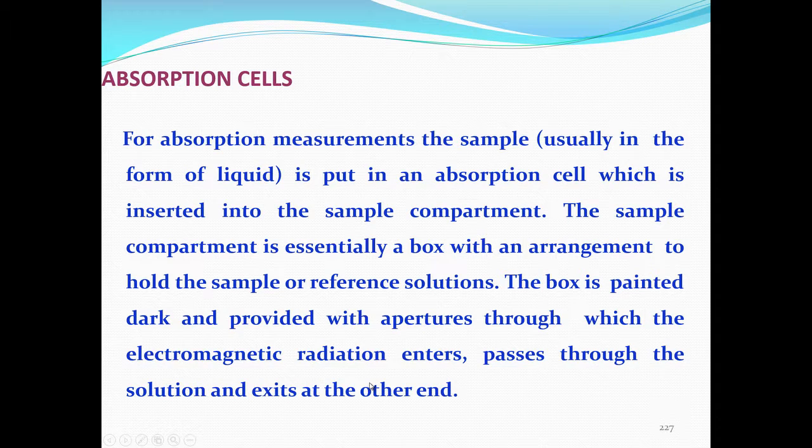So, basically the sample compartment is an essential component of the instrumentation, but the design is nothing very great, anybody can do that. The only thing is you should make sure that the sample compartment does not have any stray radiation, holes or something like that, and it should be completely dark when we close the instrument for measurement.